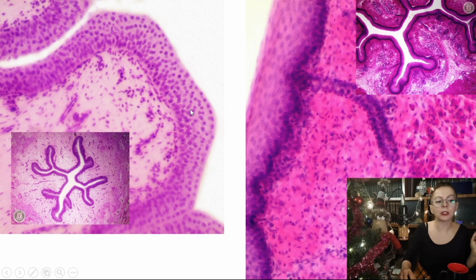And the second feature is the epithelial tissue, transitional. Here you can see rounded cells, and stratified squamous in esophagus. So you can see squamous elongated nuclei at the top. So look at the top: spherical cells, spherical nuclei, transitional, smooth nuclei. This is squamous. This is the esophagus.